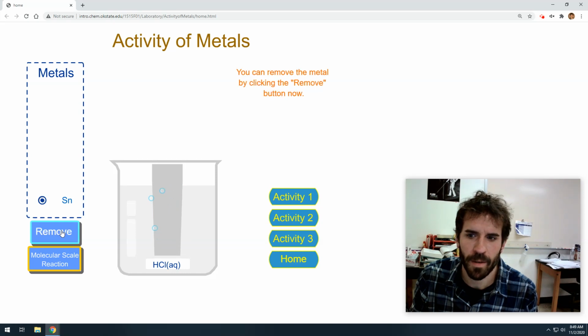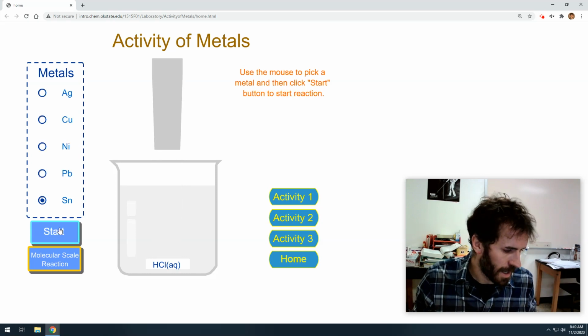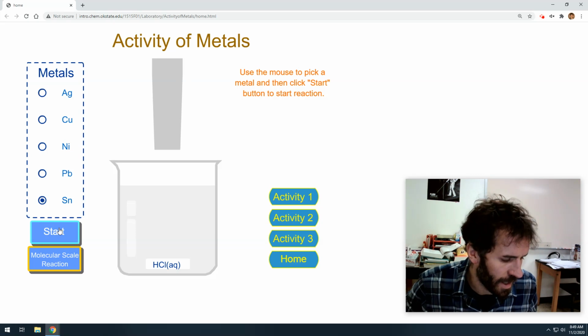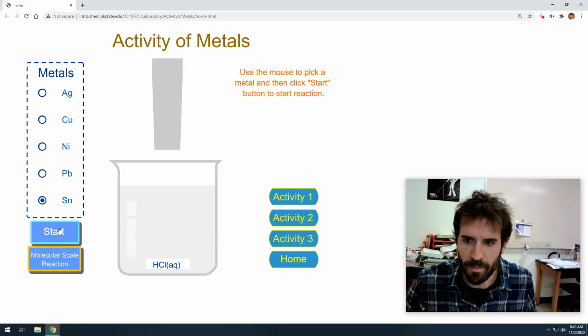Now we're going to be able to put this into our reactivity series as well, where hydrogen fits in to our series of reactivity. All right, so there are your results. And now we can add hydrogen gas and hydrogen ions into our spectrum of reactivity.